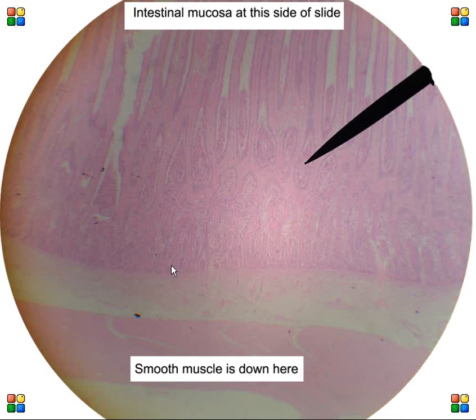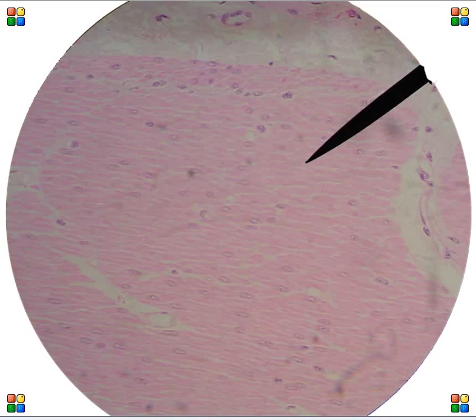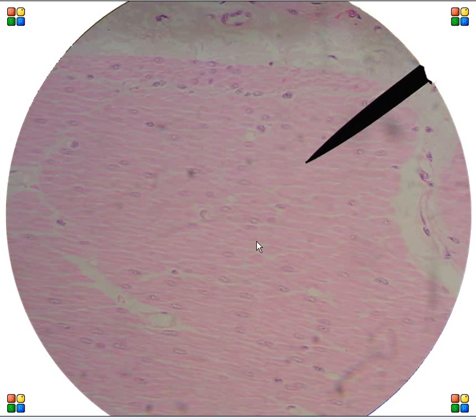This is smooth muscle. This happens to be small intestine. This is the mucosal lining. This is submucosa and then there's the muscularis or the smooth muscle layer. Let's go to high magnification with smooth muscle. And this looks very different.